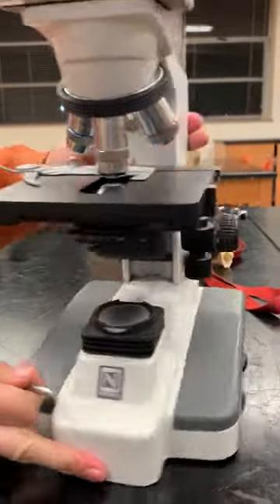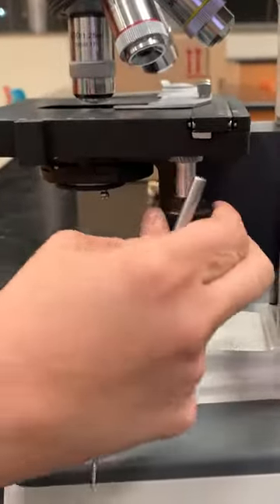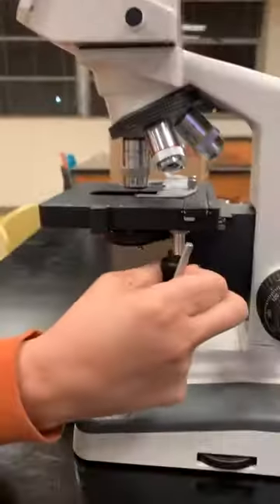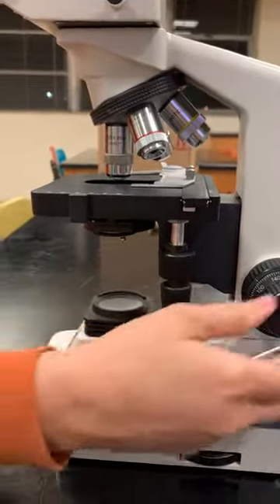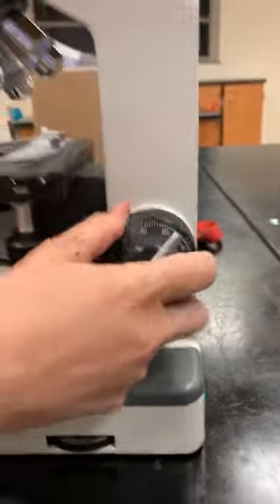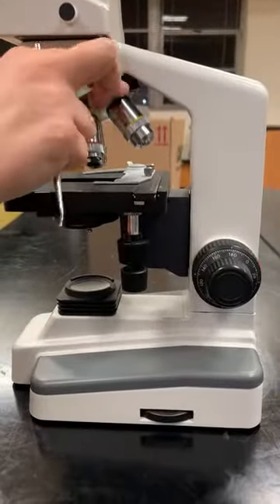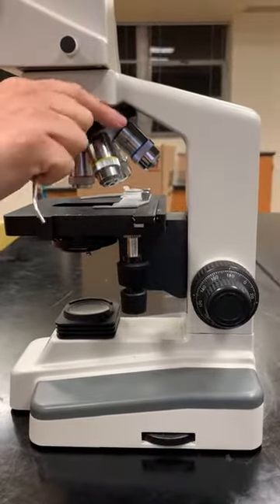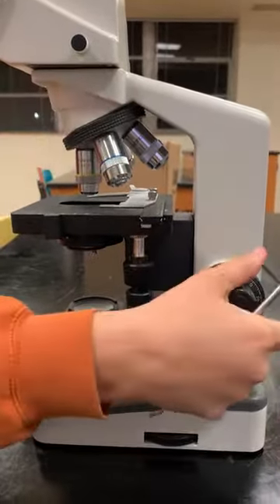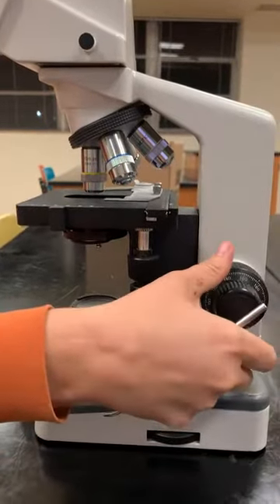When looking at the x-y knobs, this is going to move the stage forward and backwards and side to side. Your coarse focus is going to move the stage up and down. It is only used with the 4x and the 10x objective lens. The coarse focus is going to bring your image into focus.